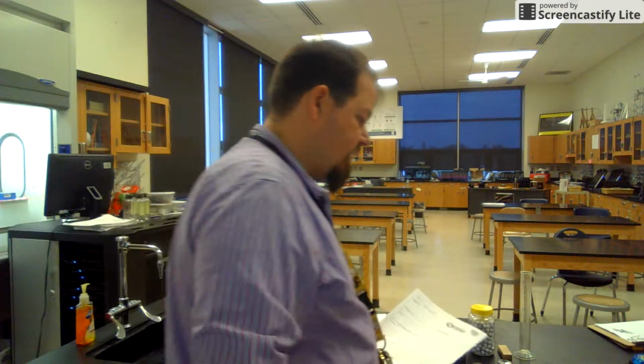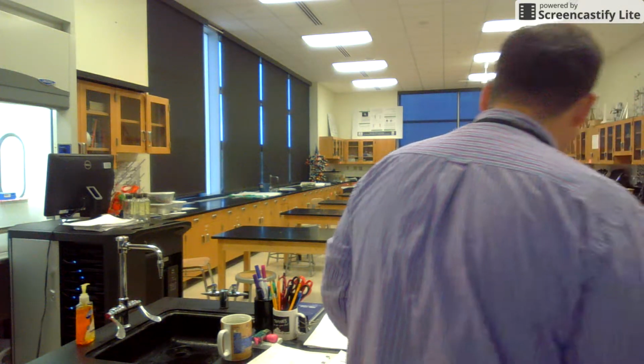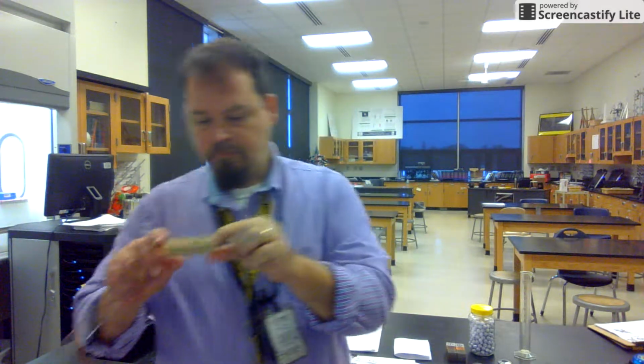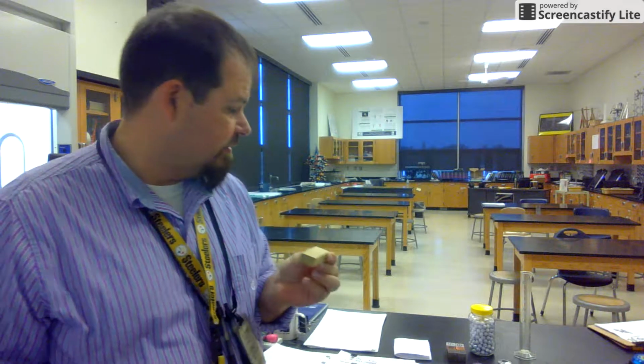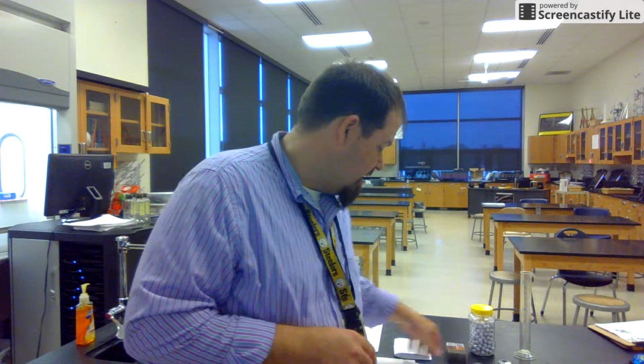We know in density we need mass and we need a volume. So for your regularly shaped solids, we're going to use a Jenga block. You are going to need its volume. So we're going to use a ruler to get its dimensions in 3 spaces. That will get you your volume. We're going to multiply length times width times height. And then you're going to use a balance, which I left in the back that I didn't bring up. It's an electronic balance. You're going to get the mass. And then you're going to be able to calculate the density of your block.